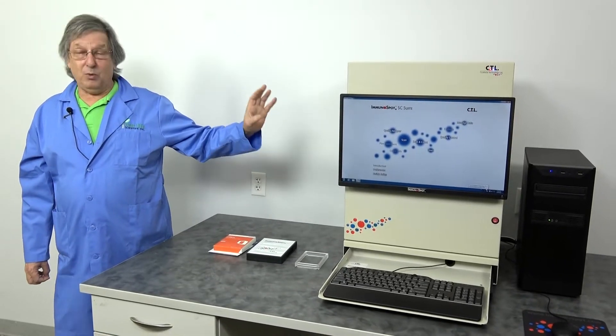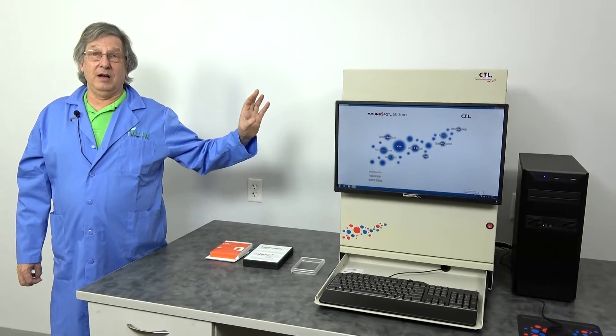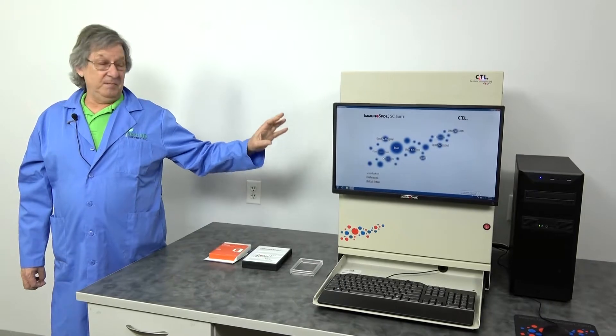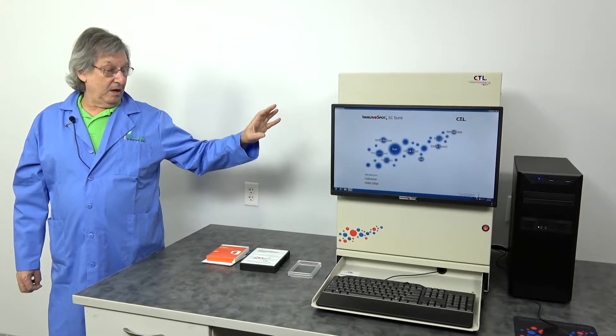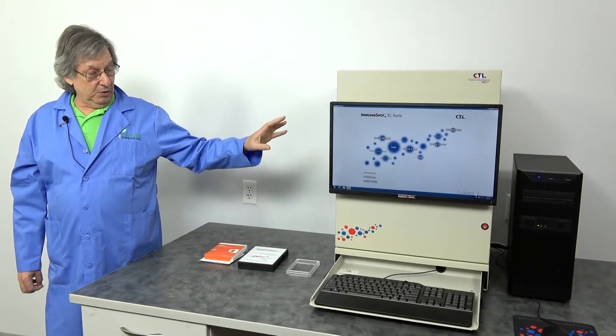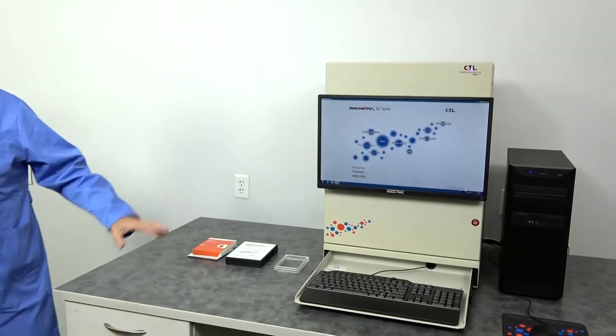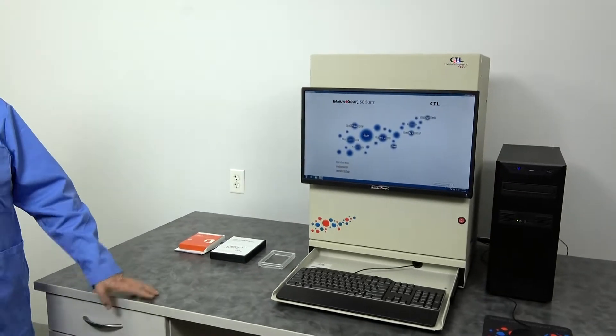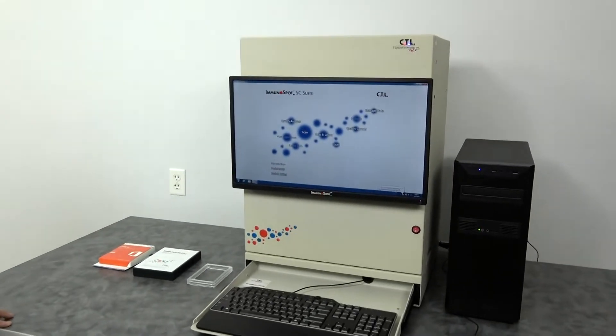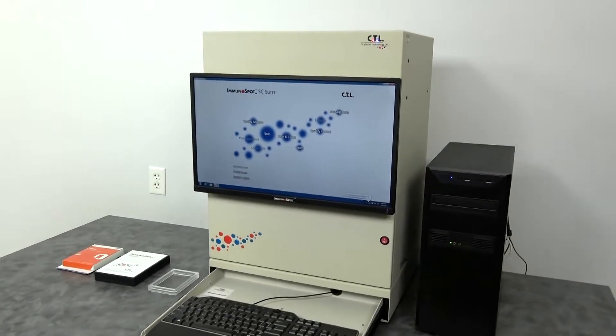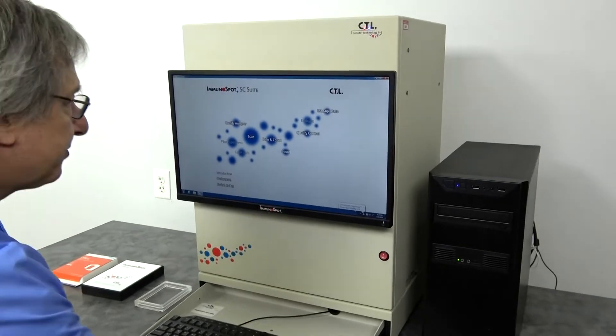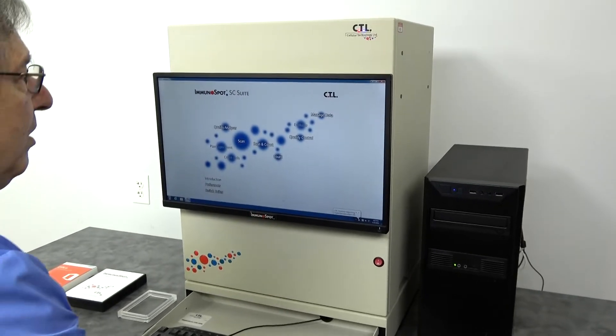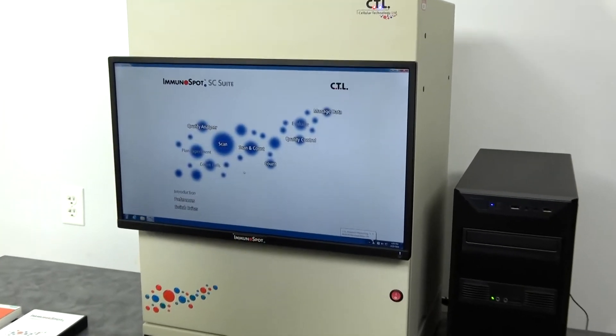As an example, we're using the CTL S6 ImmunoSpot unit. Nice little imaging system. We've had several of them come through, nice units. Very easy to navigate software.